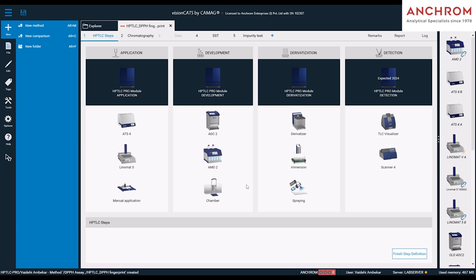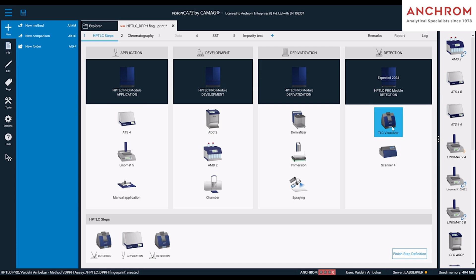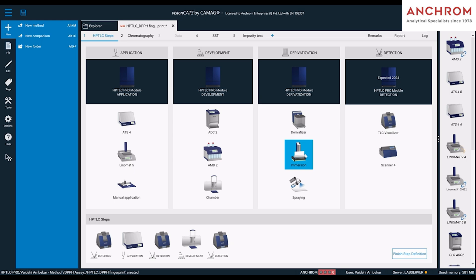For this analysis, we recommend the following CAMAG visionCATS modules which are Visualizer 2, ATS4, Visualizer 2, Twin Trough Chamber, Visualizer 2, Immersion Device, and Visualizer 2. Click on Finish Step Definition.